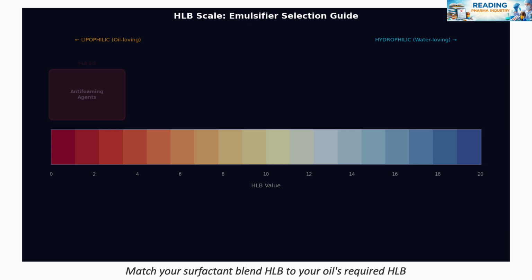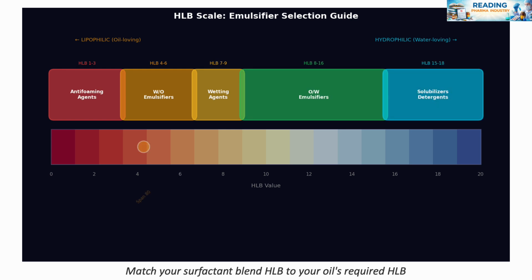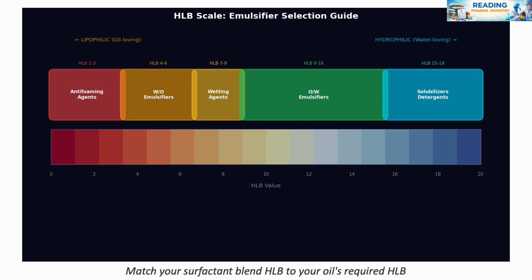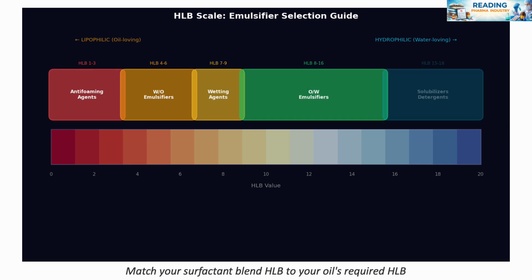Similar to the previous animation, in this case it's just to give you some classical examples. So exactly the same category where you have the HLB value or HLB scale. And it gives you things like Span 80, Span 60, Tween 80, Tween 20, SLS. Those are classical examples of surfactants that are used to form emulsions. But the idea is you just choose which surfactant you want to select to stabilize your emulsion.